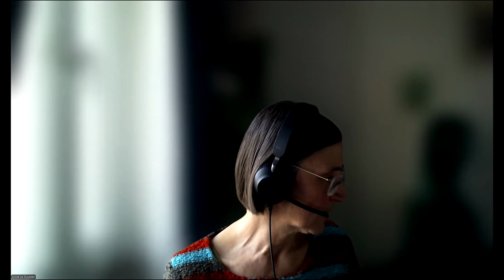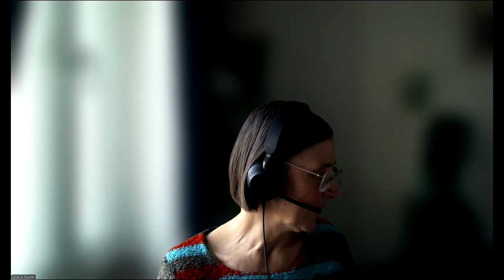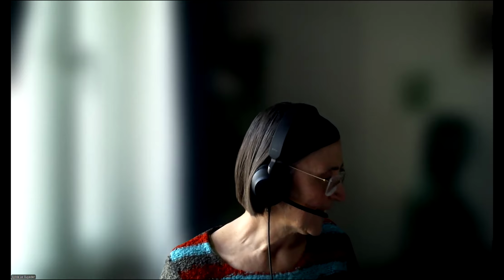I think throughout what we've done so far, we spoke a lot about the way the point spread function is formed and the light behaves and bleeds through. And then later we spoke a lot about the different hardware. So I hope that you feel comfortable with your microscope and how it works now. And today there was a lot about the objectives. And we have seen that one of the things that can be limiting with the objectives, especially the high resolution objective, is the field of view. And so we need to develop some sort of strategies to be efficient.